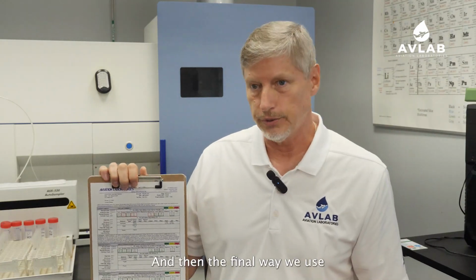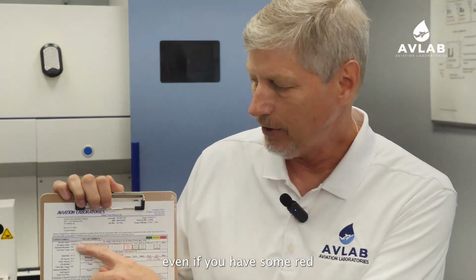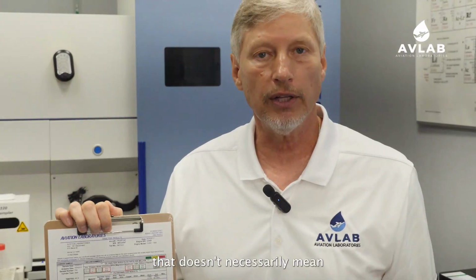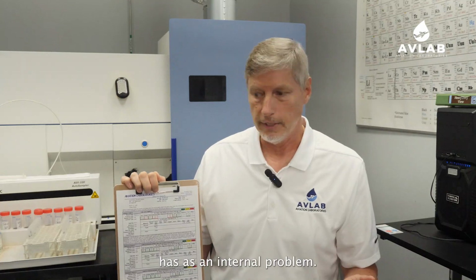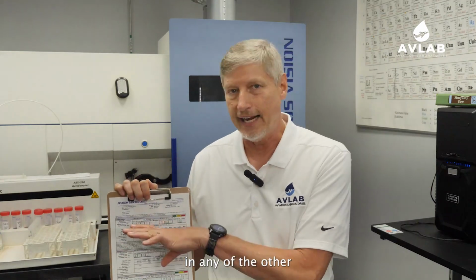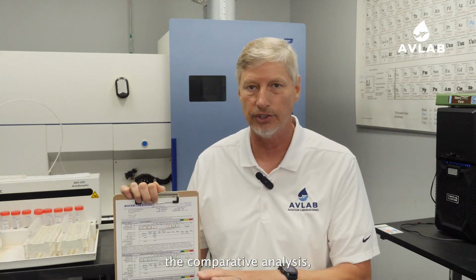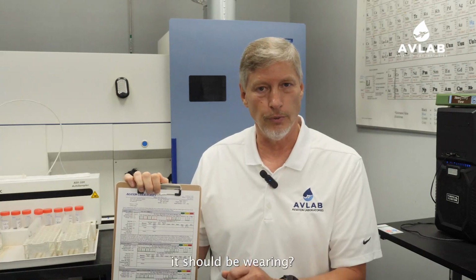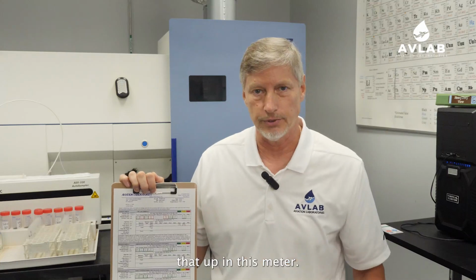And then the final way we use color is we have this alarm meter up here. Even if you have some red or yellow colors down here, that doesn't necessarily mean that your engine has an internal problem. So we like to give you an overall rating. If you're not interested in the absolute values, the statistics, the trends, the comparative analysis, any of that, and you just want to know if your engine is wearing the way it should be wearing, you can just look up here at the top, and we'll tell you that in this meter.